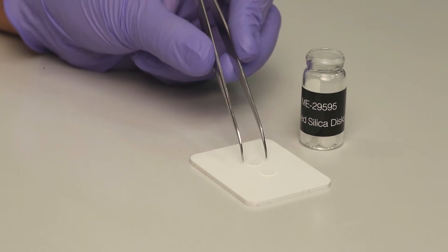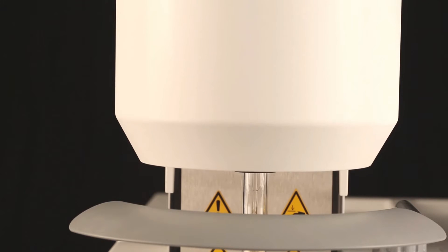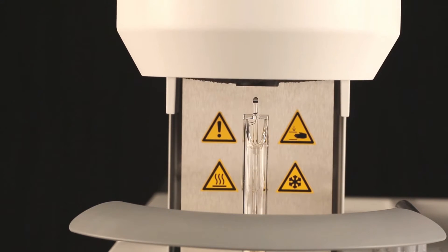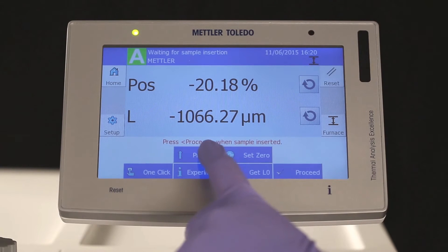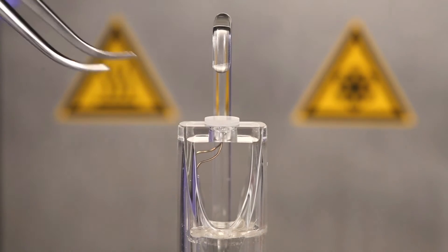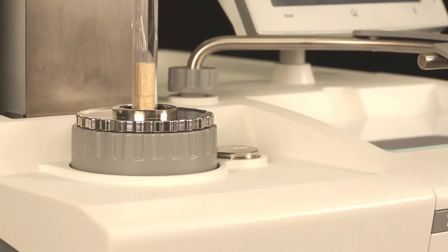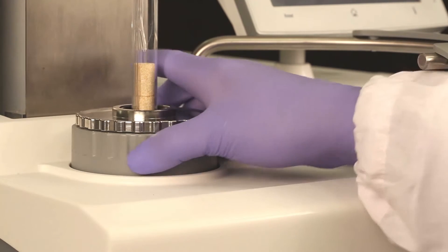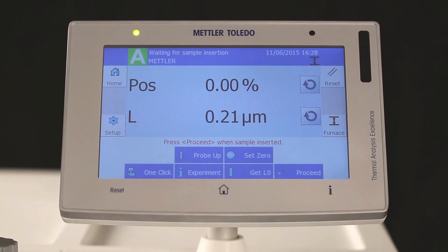Let's start with the sample preparation for dilatometric mode. Prepare two fused silica discs. Open the furnace. Lift the probe up and insert carefully the two fused silica discs with tweezers onto the sample support. Lift down the probe and make sure the discs are well positioned. Adjust the position to 0% using the height adjustment ring and then press 0.